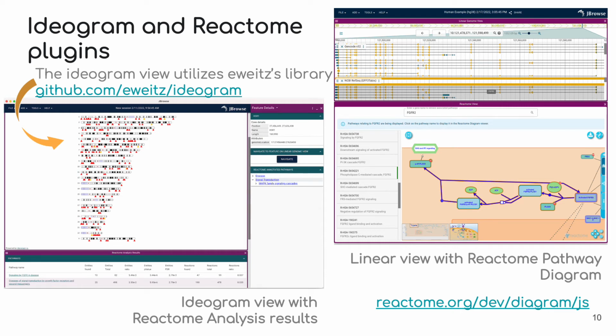Utilizing these plugins, biologists can provide an HGNC formatted list of genes of interest, and have Reactome fetch and display the pathway analysis directly inside JBrowse, alongside a table representation of the same information. The gene list can also be annotated on the ideogram view, resulting in 3 data-rich representations of relevant information derived from Reactome. Because these views are embedded within JBrowse, all the retrieved data can be synergized with JBrowse components and, for example, can navigate to a given feature's location on a linear genome view.